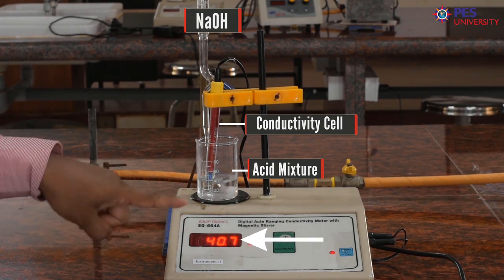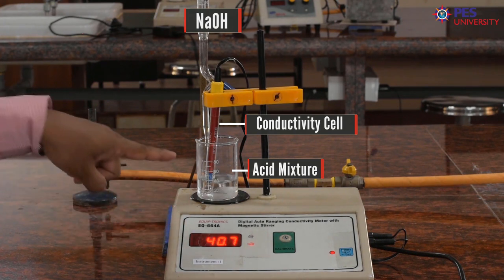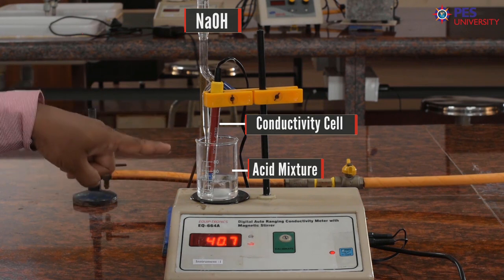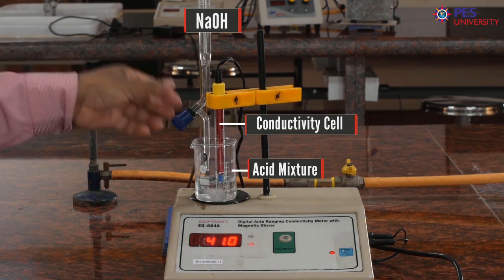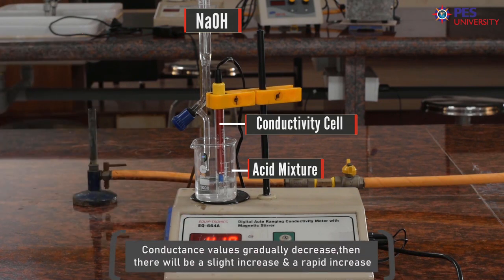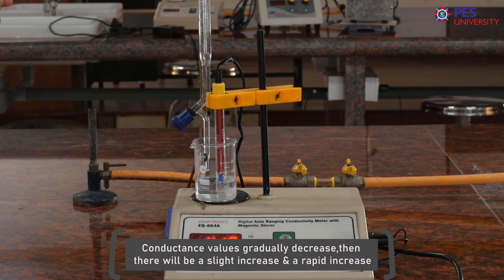Actually conductance values decrease because high mobile H+ ions which are there in the solution are replaced by low mobile Na+ ions which are there from the NaOH solution. After that, continue the addition of NaOH from the burette into the acid mixture solution. Conductance values gradually decrease, then there will be a slight increase in the conductance values, then there is a rapid increase in the conductance values.